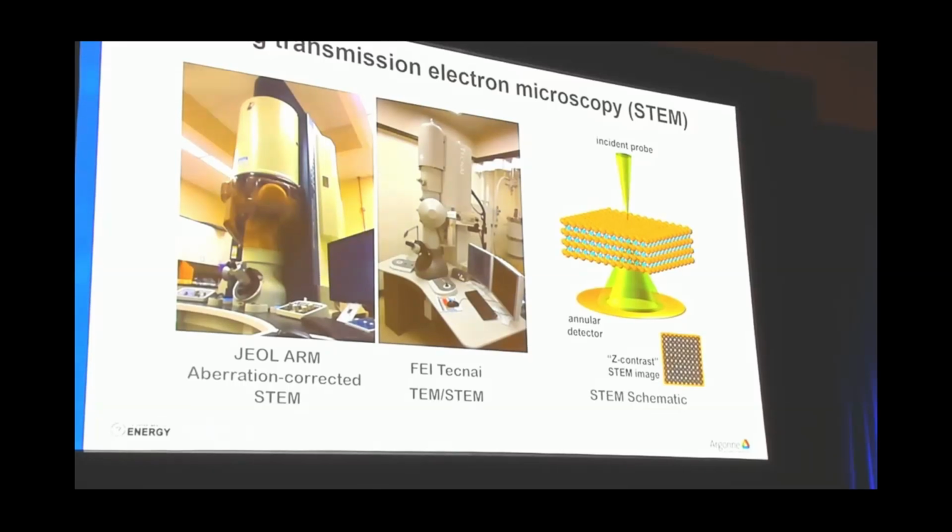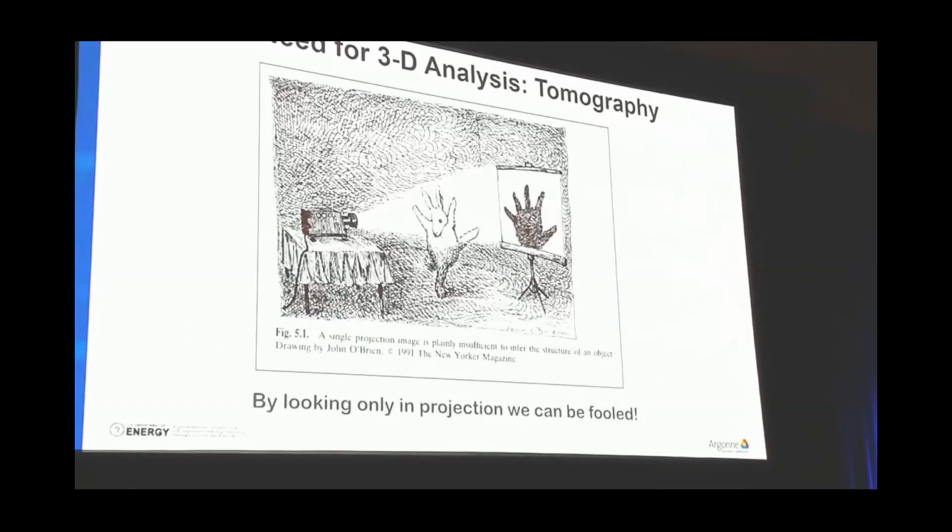And finally, for in situ liquid imaging, if you have a TEM where you're just chunking all the electrons down at the same time, you can get bubbling and lots of beam effects that you don't want to see. The small focus probe of the STEM, as it moves across the windows with the liquid in there, naturally dissipates the energy so that we don't see that bubbling unless you put, again, a lot of electrons in there.